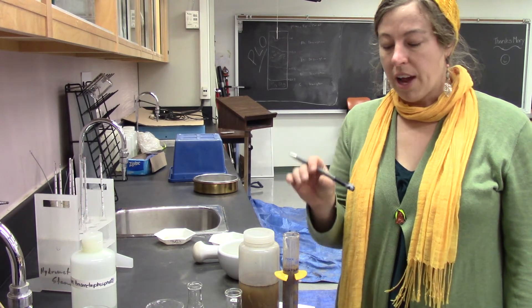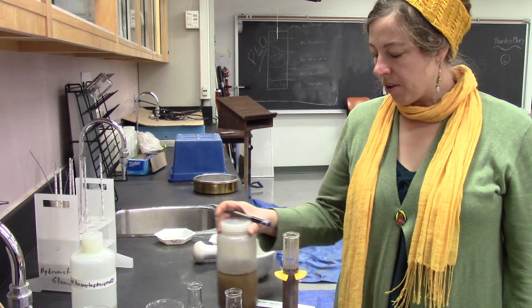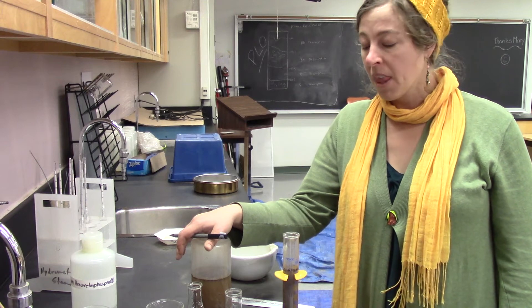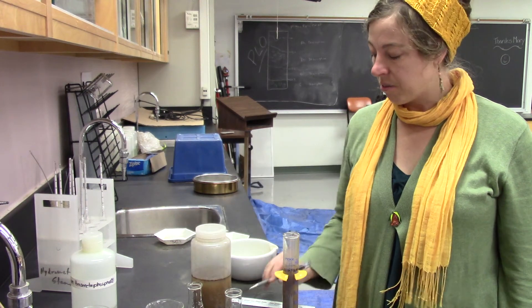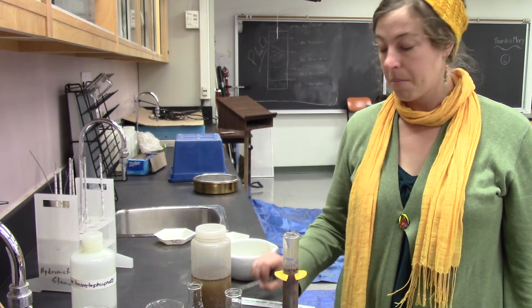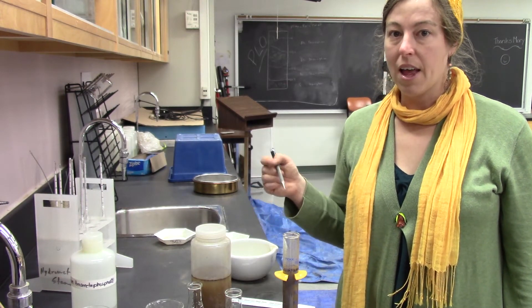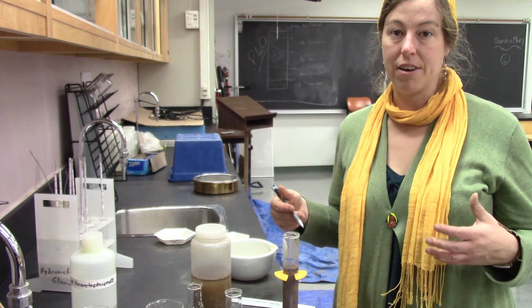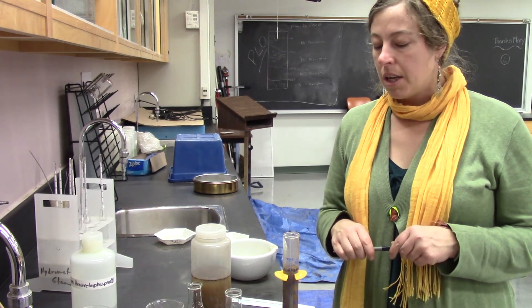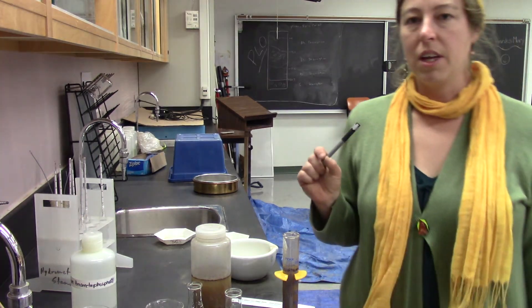In the lab manual I have instructions on how to do this if you have a cylinder, and some general guidelines if you're using a jar at home. The narrower the better, because then you need less, but you need enough dirt that you'll be able to measure increments of settling. You need to find a jar that's appropriate and will hold enough sand to make the system work. The amount of water is less important than the sand that is settling out.